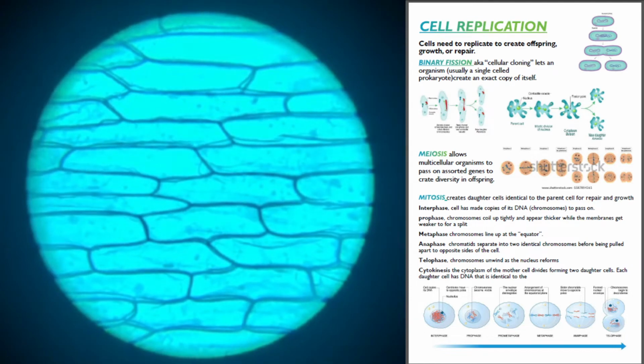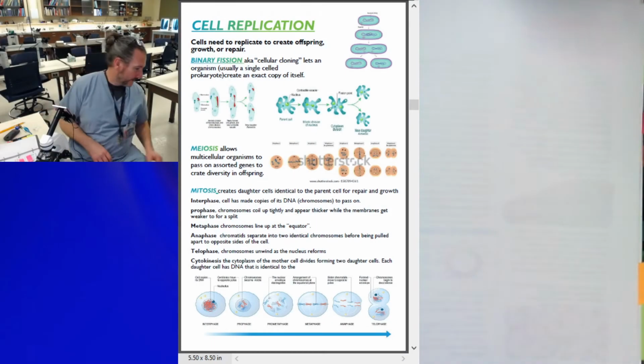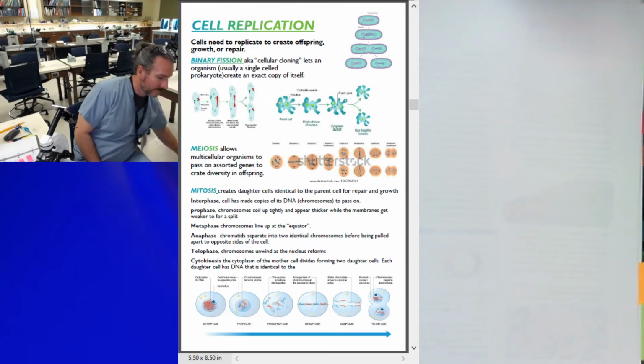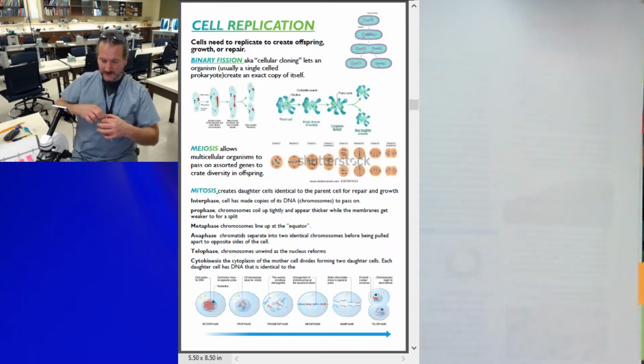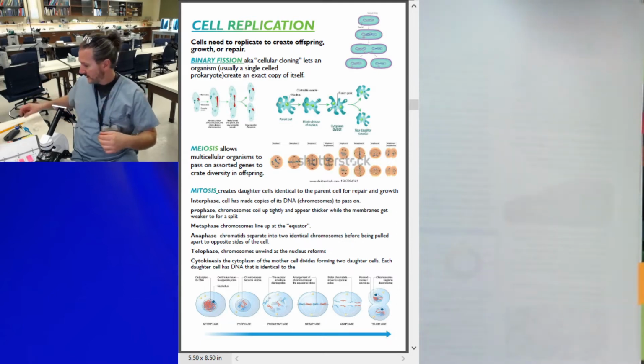So I'm going to do something a little bit different. I actually sent with you some minced dried onion. So what you can do is get one of your clear plastic bags, just like this. Take some of that minced dried onion, put it down in the plastic bag, fill up with water and leave it. If it's warm water, probably like a half hour on the table.